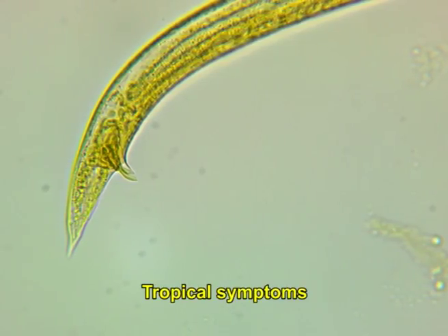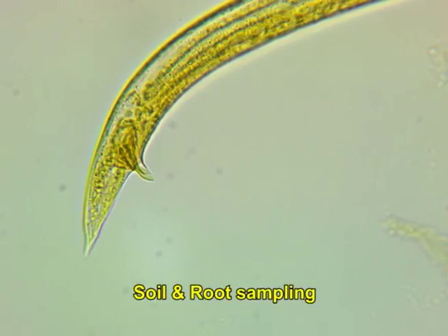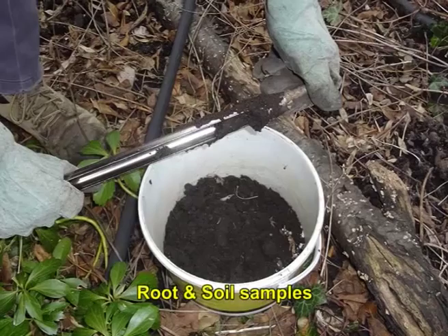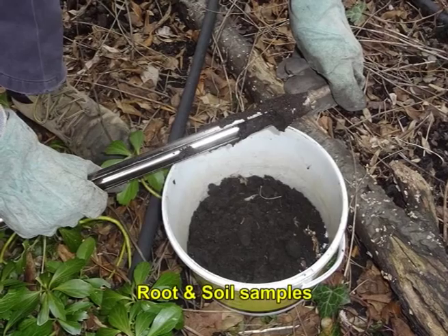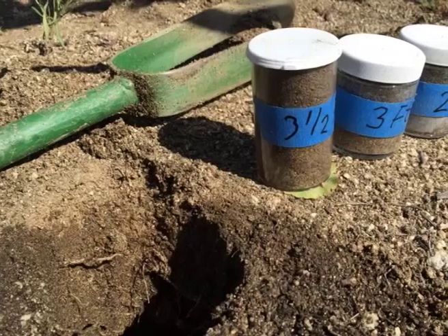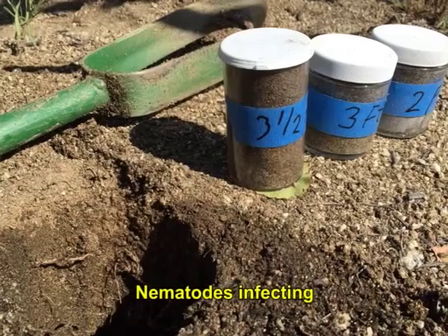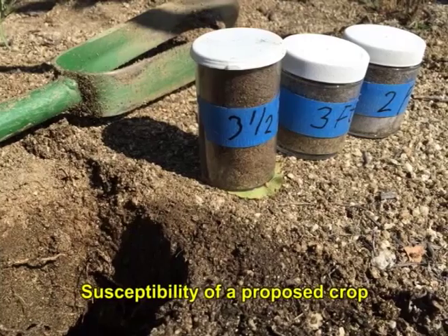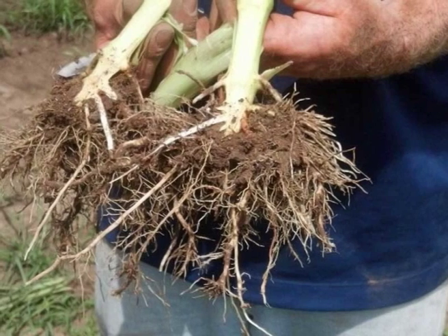In order to correctly detect nematode infection, soil and root sampling of the infected field is mandatory. Root and soil samples have to be extracted and sent to a laboratory so as to identify and count the nematodes linked to the injured plants. Soil and root sampling enables one to diagnose the type of nematodes infecting the field and also helps in establishing the susceptibility of a proposed crop. This in turn helps in predicting the damage to the crop.